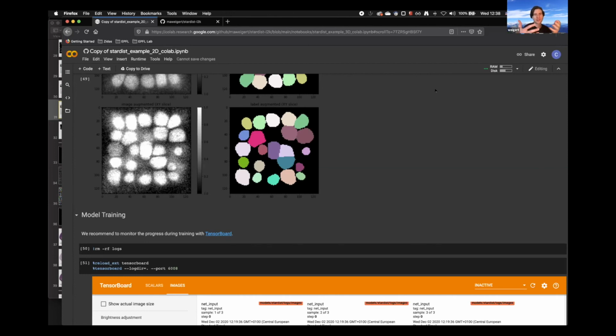But together they would cover all the different outlines that you want to get. Then you could just pass those two channels as input, and it will learn that it should use both of them simultaneously, right? Or sometimes you have a nuclear marker that is not expressed in some cells, but you have a membrane marker that is active for these instances, and it will just use both of them, if this is what you want. If you don't want a specific marker to be relevant for the decision, then just exclude it from the training.